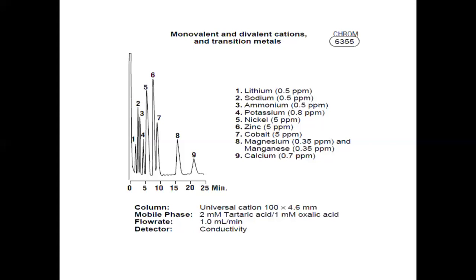We cannot utilize either spectrometric or fluorescent techniques because these are inorganic compounds. No question of aromaticity, no question of conjugation. So this is the only suitable technique for the separation of ions.